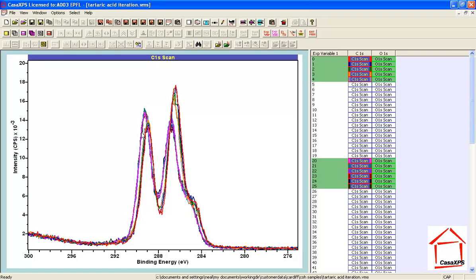So while the charge compensation locally seems to be quite stable, over a period of time there does seem to be some type of evolution. But nevertheless the peak shapes are reasonably stable, they certainly look well formed, so we would not expect charge compensation to have a major influence other than a peak model would have to shift in position to accommodate changes in the spectra in this sequence of measurements.